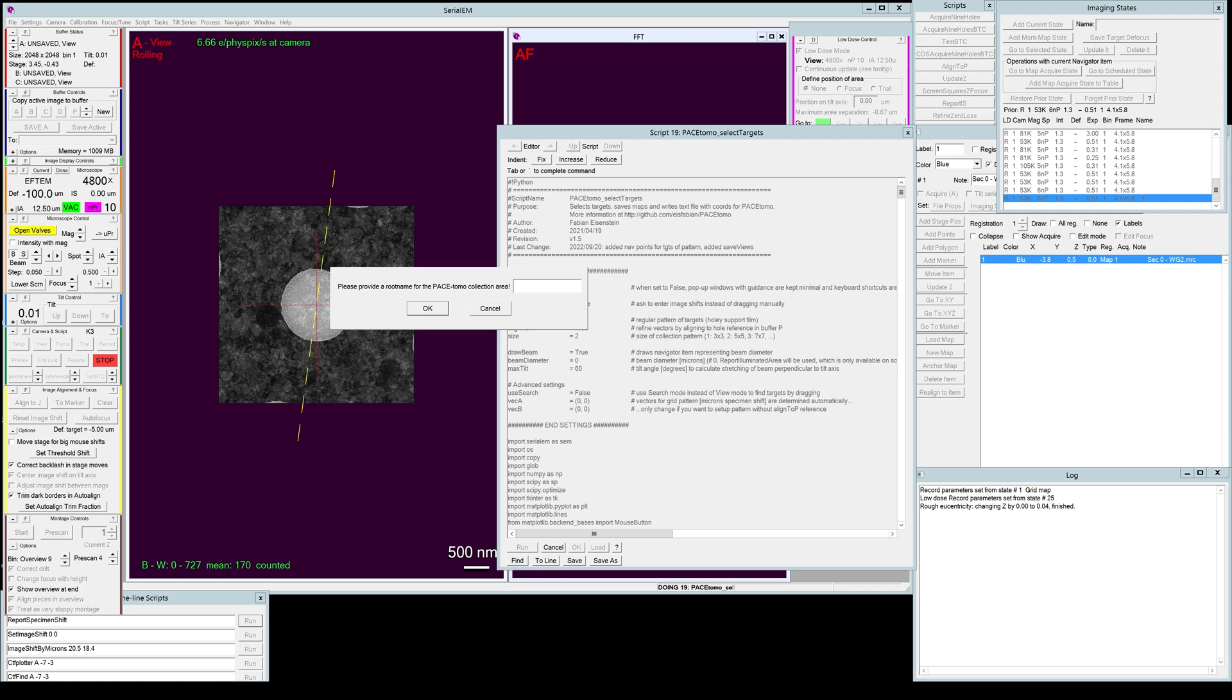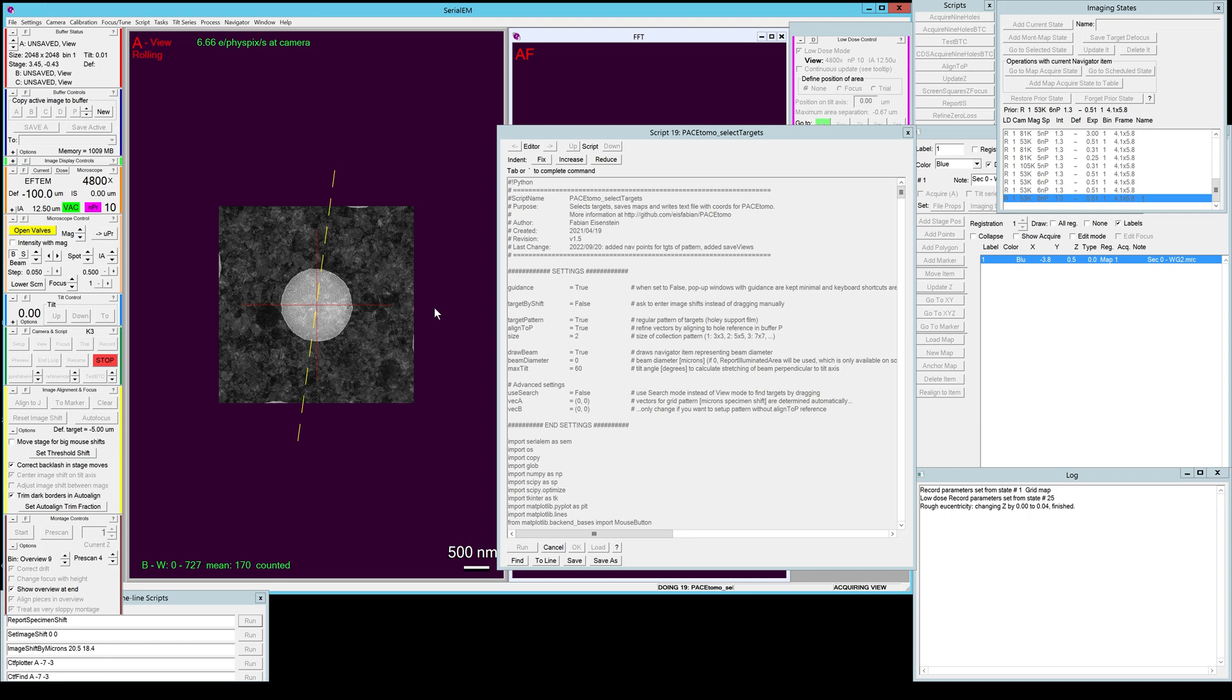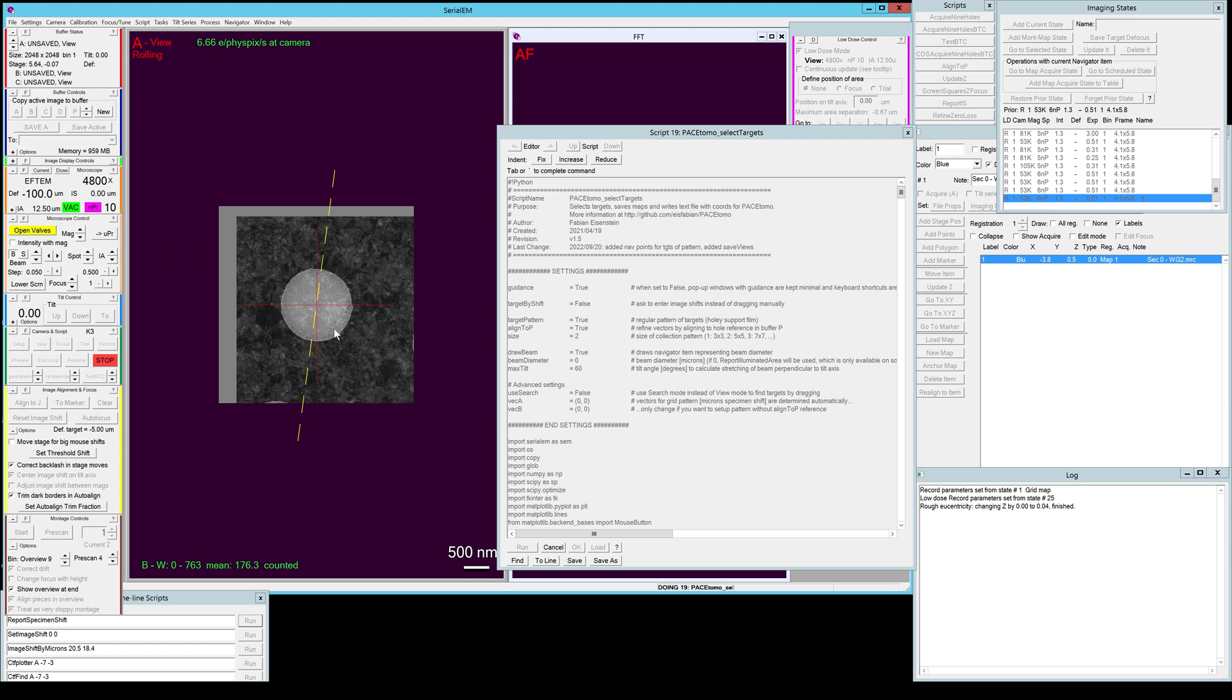The next step is taking a view image and aligning it by comparing it to the hole reference. Of course in this case the hole is identical so the alignment should work really well.